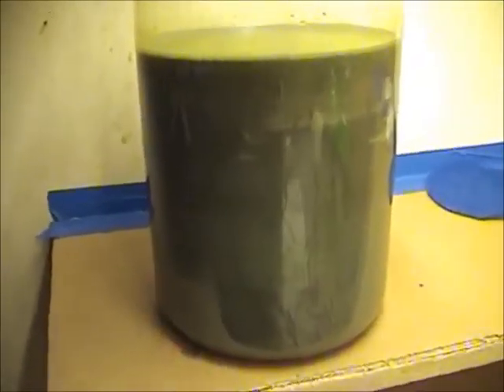Okay, gentlemen, I'm back. I had to put a watch glass on top of this beaker here. If you'll notice on the side of the beaker, I took a stir rod and made some scratches. What happened was the whole inside of the beaker turned silver, like a silver backing on a mirror. Our silver is precipitating out right now, I can promise you that, but we just can't see it through this beaker because it's done silvered up.